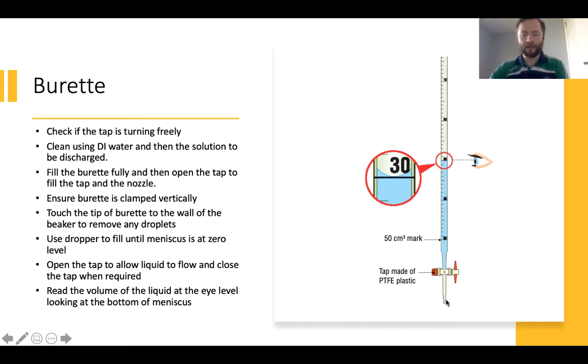...we can touch the tip of the burette to the wall of a beaker so that any droplet that might be stuck at the very tip of the burette is also removed. The next step would be to fill the burette fully to the graduation mark using the dropper. We make sure that our eye is kept at the level with the meniscus.